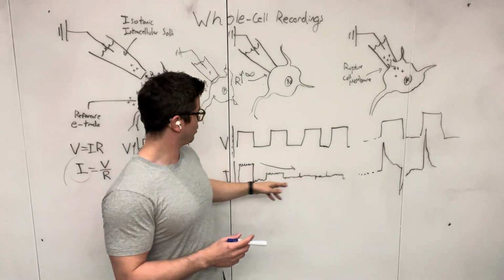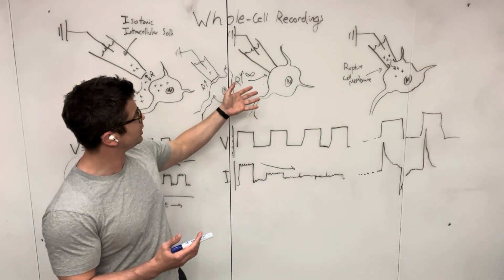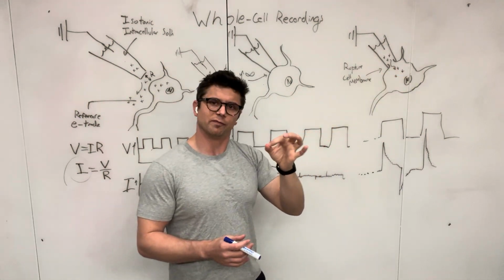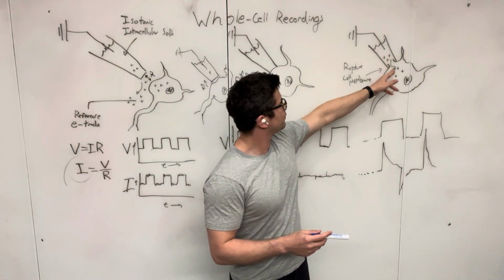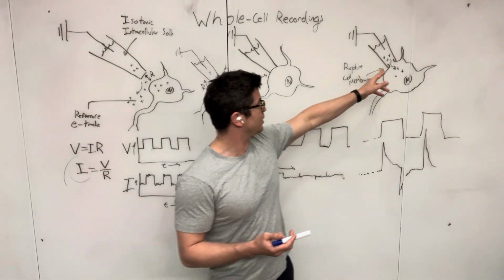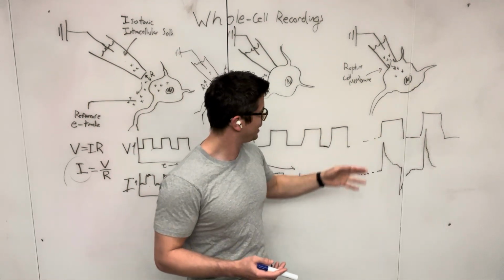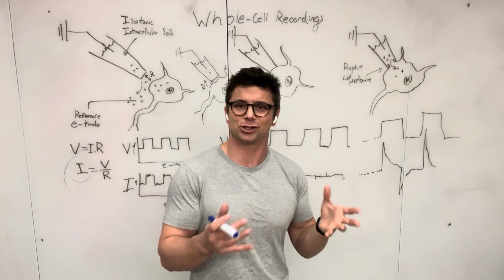This is called a gigaseal. So you're doing your voltage steps, but you're getting no current generated. Okay? At that point, you're in the attached patch mode, and you then apply a little bit more suction, and you actually rupture the little circle of membrane at the tip of your recording pipette, so that there is free flow of ions between the intracellular solution in your micropipette and the inside of the neuron. At that point, you also see a change in the current generated for each voltage step, because now you get this big curve, because the cell membrane actually holds charge and discharges it.